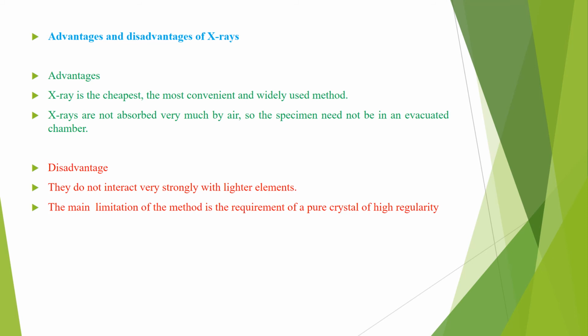And then when we discuss the disadvantages of the X-rays, these are that they do not interact very strongly with lighter elements.